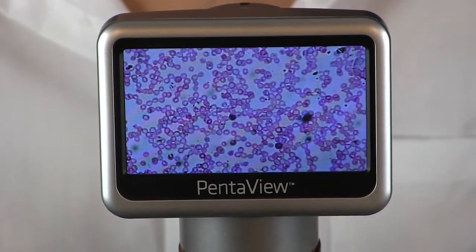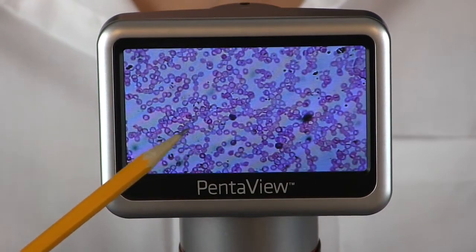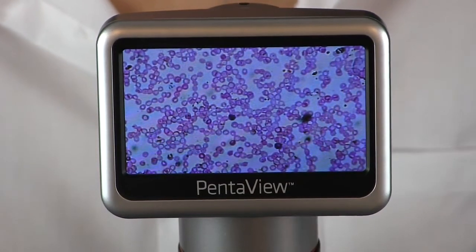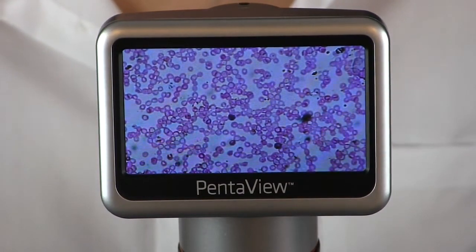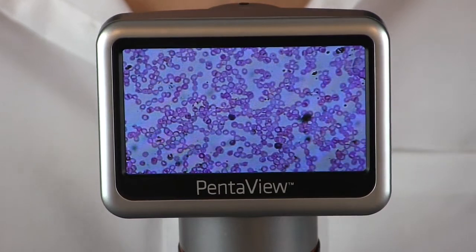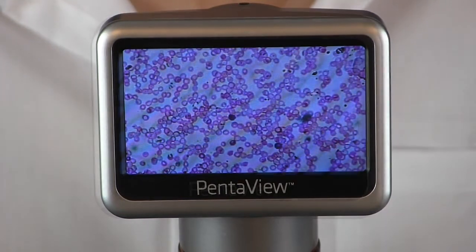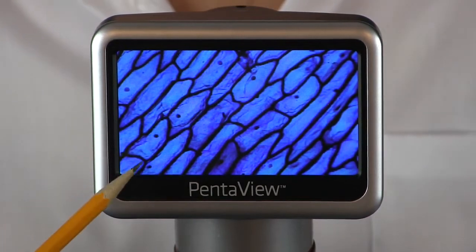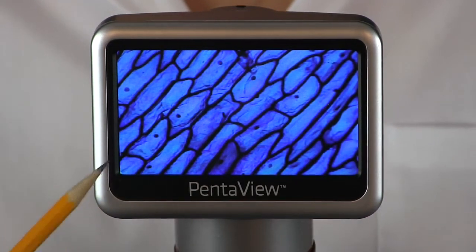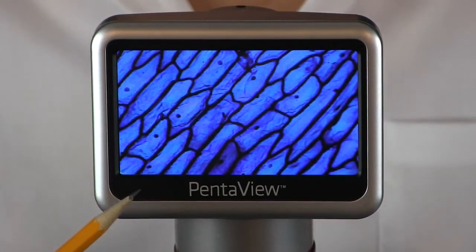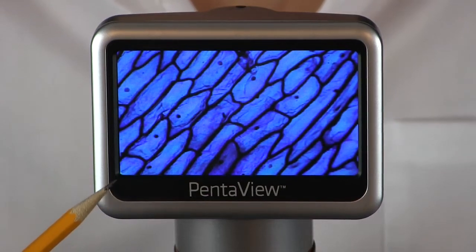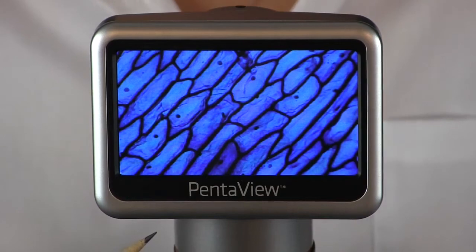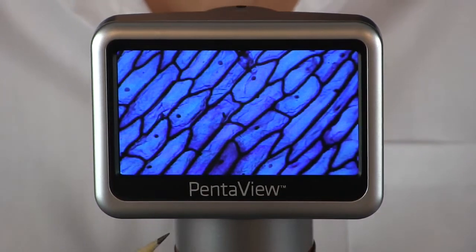Take a look at this slide. These are human blood cells. They are round so that they can carry oxygen to do their job — they carry oxygen to all the other cells in our body. These cells come from an onion plant. See the dark dot in there? That's the nucleus surrounded by the cell. Can you see how dark the cell membrane is on the onion plant?